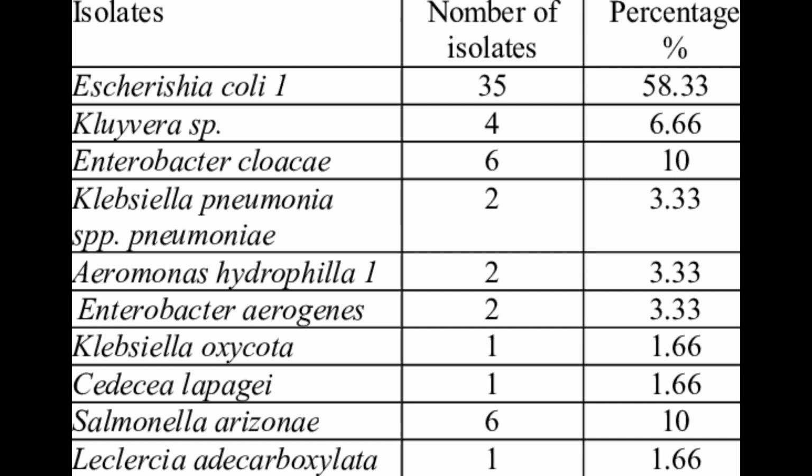Their medium is decarboxylase medium with bromcresol purple, then glucose and amino acid medium overlaid with mineral oil. The result is purple, useful to differentiate Klebsiella from Enterobacter, the decarboxylase.